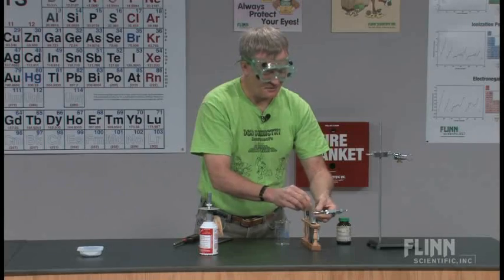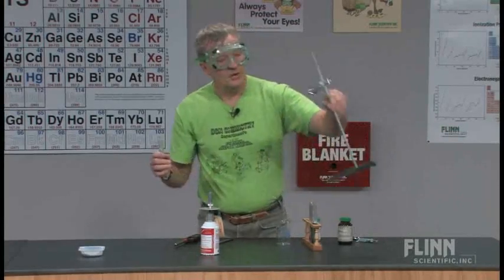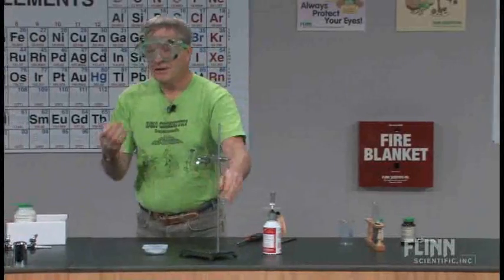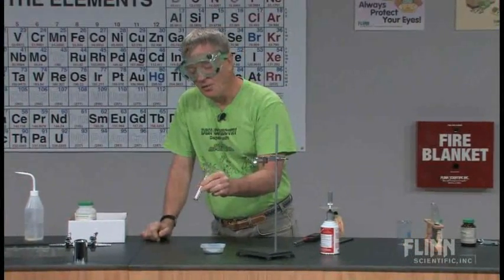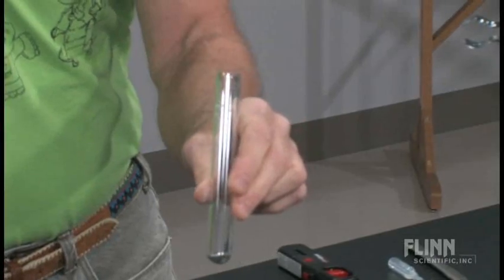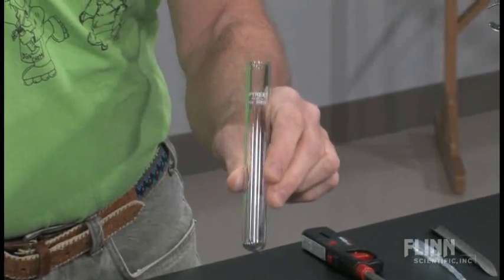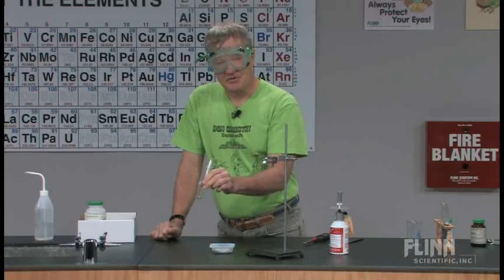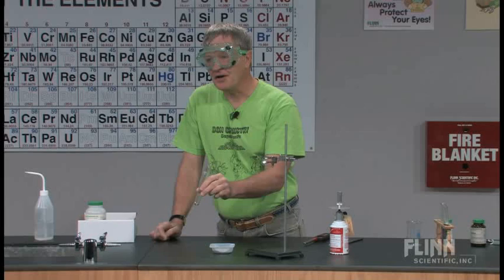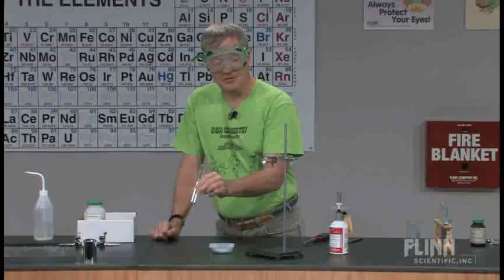in a test tube. This time, you want to use a heavy wall Pyrex test tube. What we used to call an ignition test tube. Not sure that they still sell them as ignition test tubes, but get a heavy wall Pyrex test tube. If you use some of those culture tubes that you find for sale, the thin glass ones, in a very short period of time, you'll see why that's not a good thing to do.